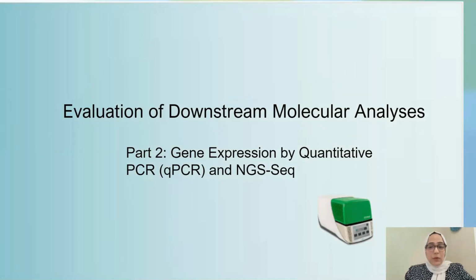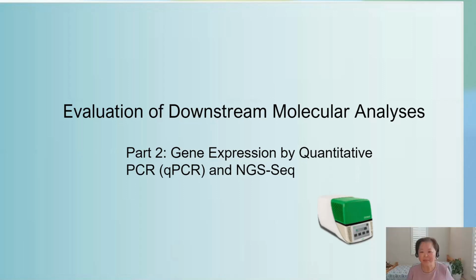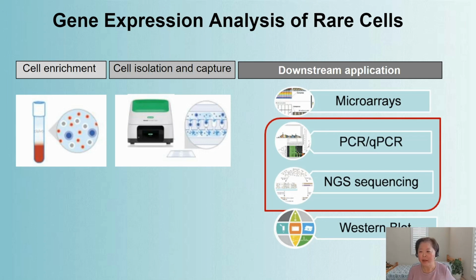Now my colleague Cissy will continue our talk on the evaluation of downstream molecular analysis using gene expression by quantitative PCR, qPCR, and NGS sequencing. Cissy, the stage is yours. Thanks, Mina. Yeah, hello everyone. Now I'm going to talk about other downstream molecular analysis.